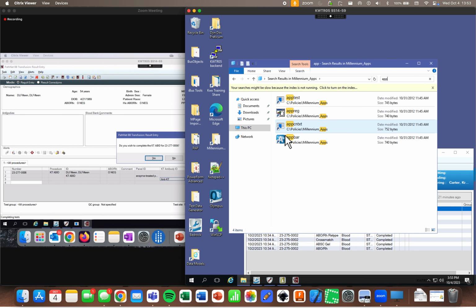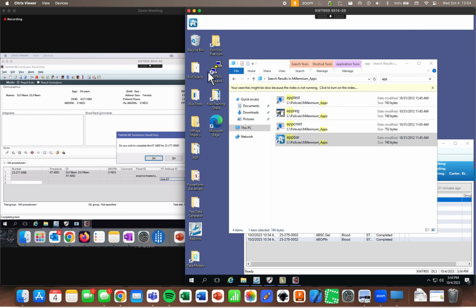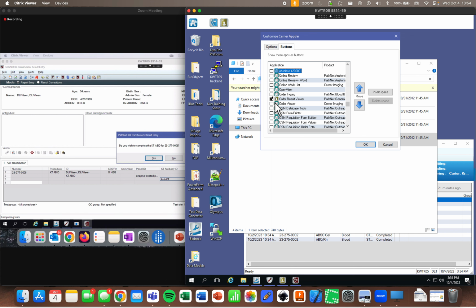If we have things like antibody identification, antigen typing, cross matches, where we might potentially later on need to add additional results, it's usually easier to leave the order in process than to have to complete the order. Otherwise, if we need another antibody ID done, we then have to re-add the order and go through the whole kit and caboodle again.